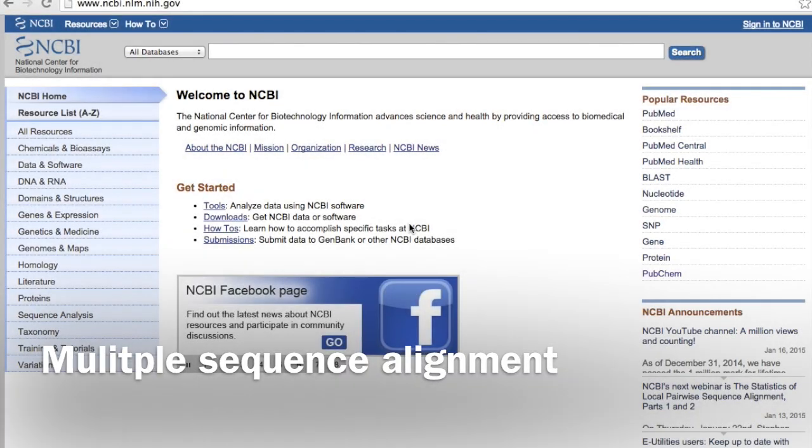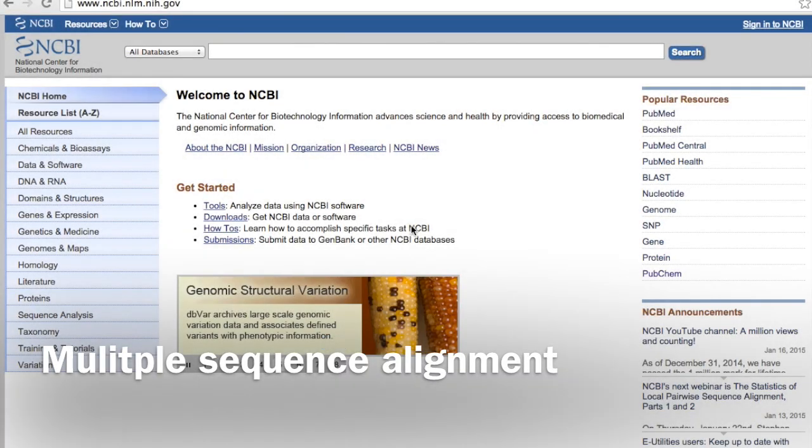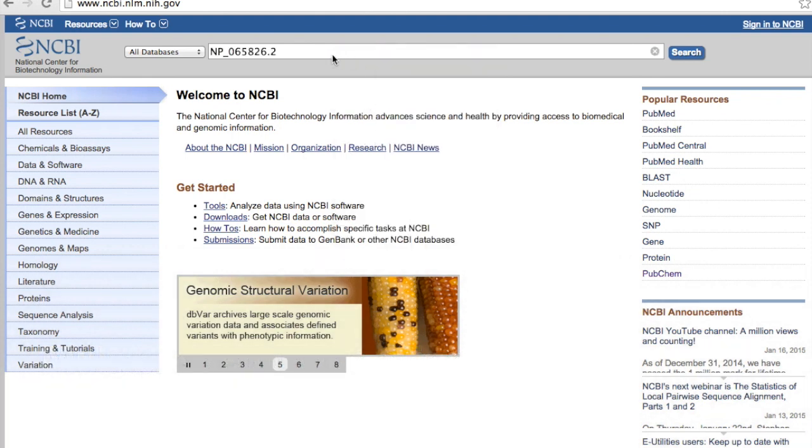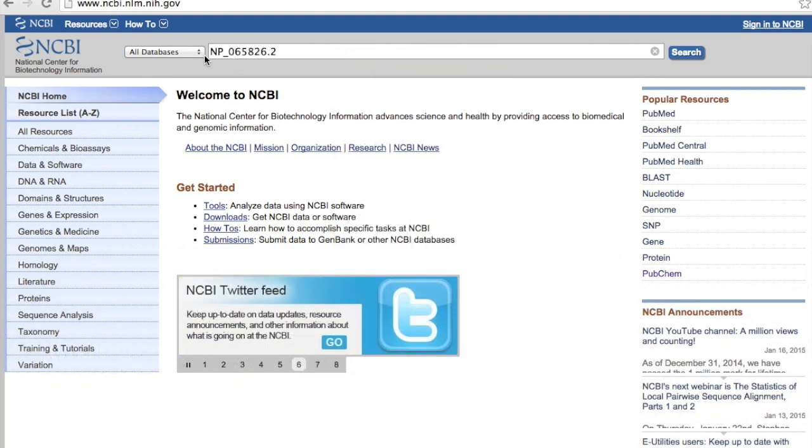Today I will show you how to do multiple sequence alignment using a hypothetical protein. And this is my hypothetical protein.